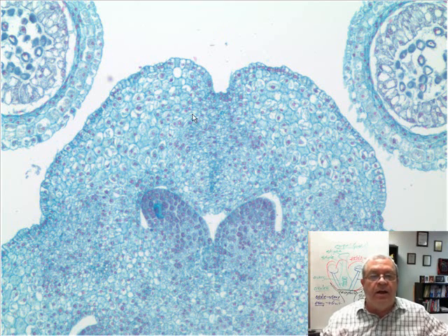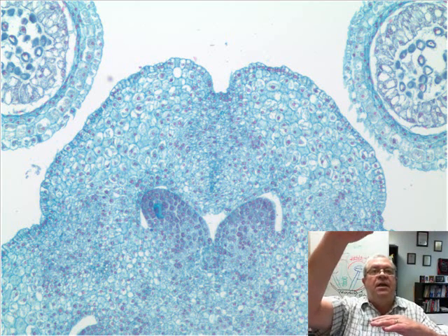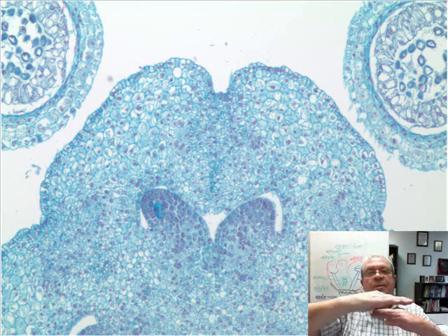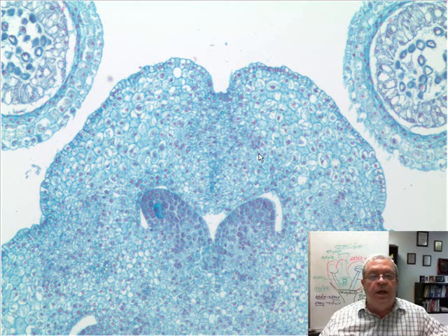And finally, our final slide, as we come to the center, we can see a couple of different anthers peeking at us at the upper right and the upper left. But what is this? We're in the smack dab middle of the flower now, so we must be in to the female part, right? Some part of the pistil or carpel. Some part. Which part? Well, we got the stigma, the style, the ovary. Where was this slice made? Well, it was made down low through the ovary. And so what we see here is the ovary.